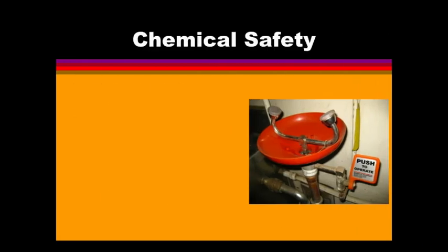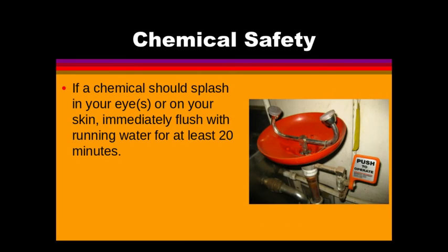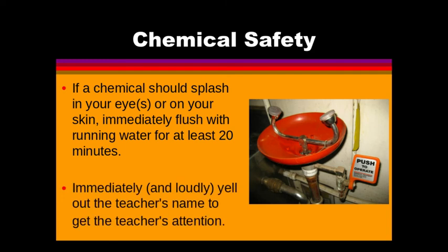All right, so this is a typical picture of an eye wash. This isn't exactly ours. But what happens is water kind of bubbles out of those little faucets, just like a water fountain. And we hold your eye open and we just kind of carefully stick it in there. Okay? So if something gets in your eye, you're going to immediately tell me. I'm going to come to you. We're going to go over and take care of it while everybody else keeps doing what they need to do.